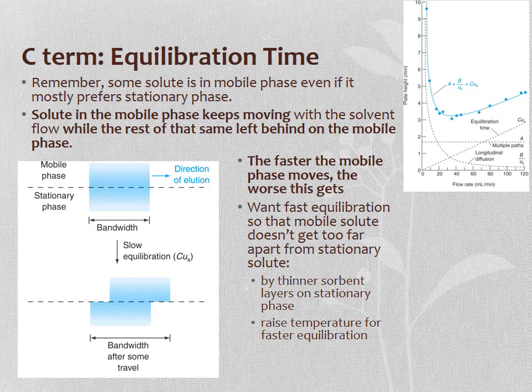Now the C term is the hardest one to describe. It is the equilibration time. So you have to remember that some of your solute stays in the mobile phase, even if it mostly prefers the stationary phase.